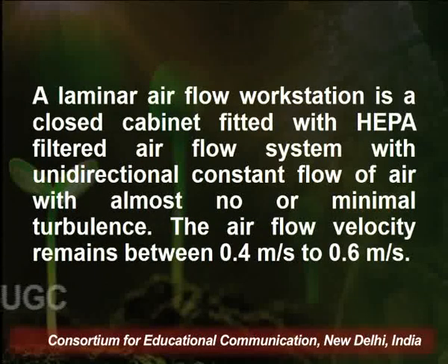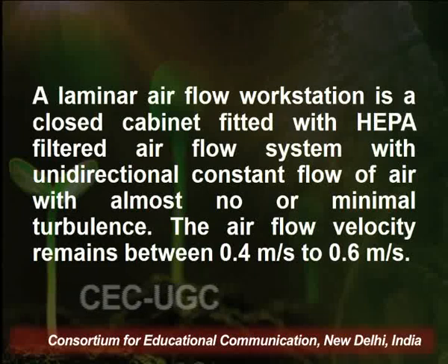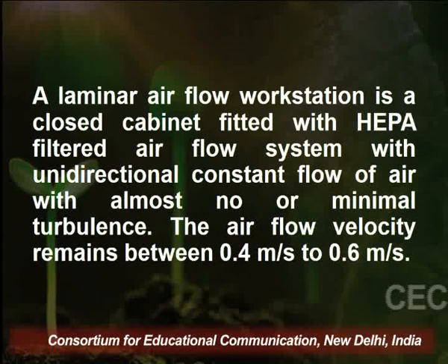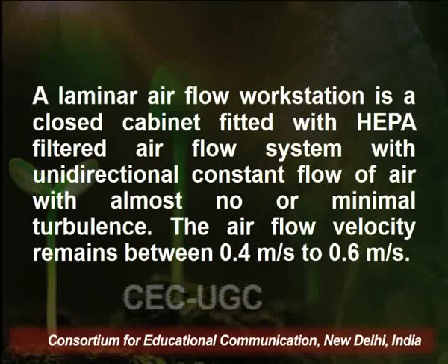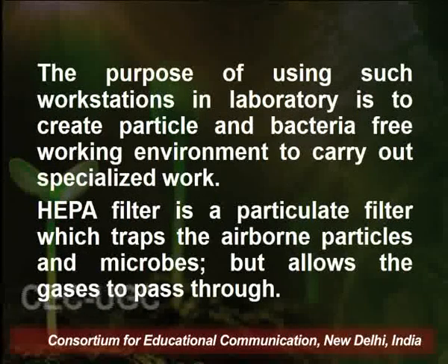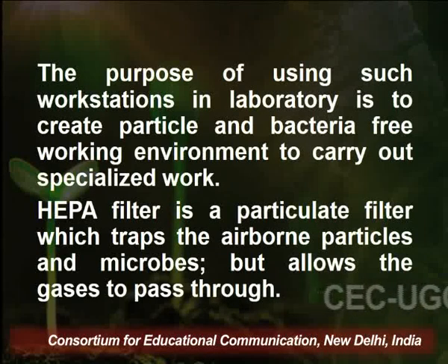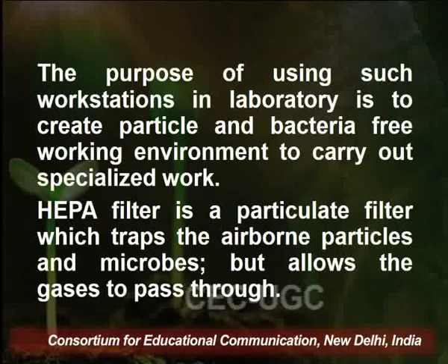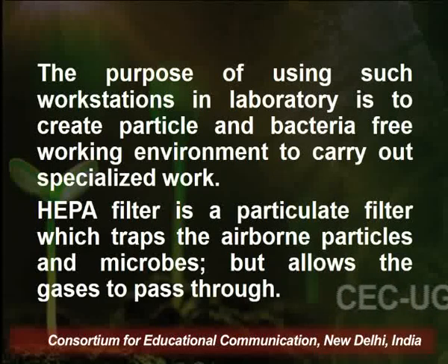A laminar airflow workstation is a closed cabinet fitted with a HEPA filtered airflow system with unidirectional constant flow of air with almost no or minimal turbulence. The airflow velocity varies from 0.4 meter per second to 0.6 meter per second. The purpose of using such a workstation in the laboratory is to create a particle and bacteria free working environment to carry out specialized work.